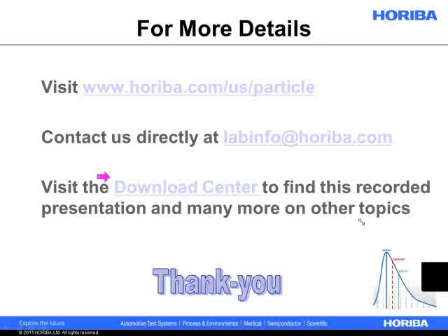All right, I'm going through past questions that have been sent in. There's a question about, effectively, how much does this person have to worry if their particle is very strongly needle-shaped, has a very high aspect ratio? And it depends. I know that sounds like a cop-out answer, but it's also an honest answer.